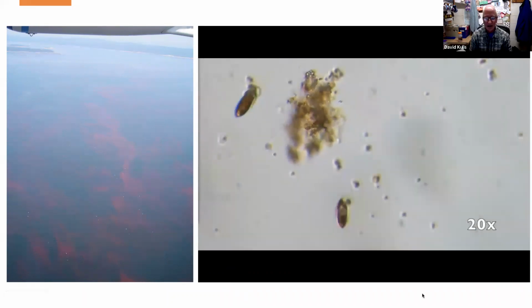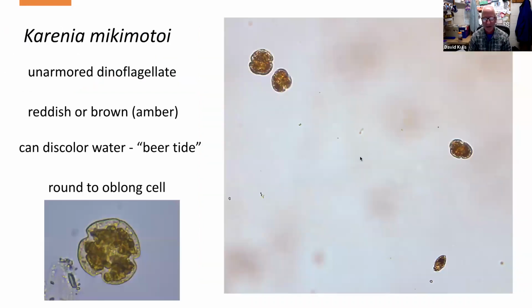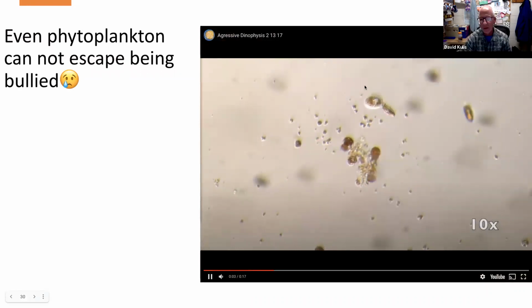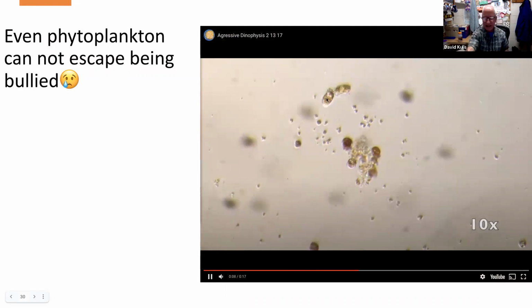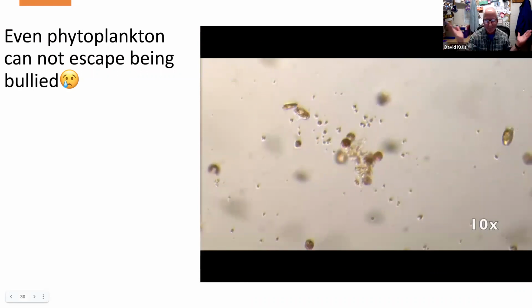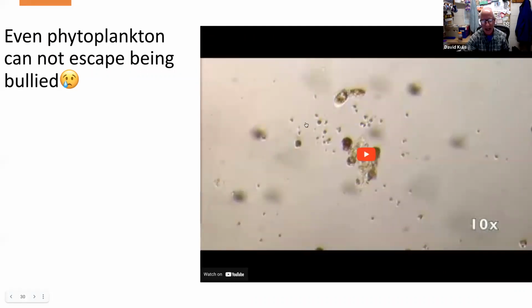Okay, we can go on to the next slide, please. And this is just kind of a cute little video that I found where even Dinophysis, even phytoplankton cells, can be aggressive. And look at this guy right here. He's just bossing this other Dinophysis cell around and pushing him away. And, you know, it's like, you just can't escape it. There's bullying happening everywhere in culture.